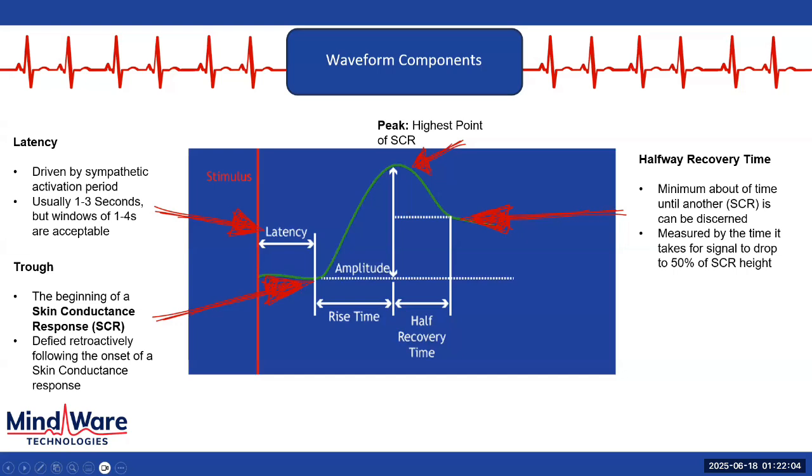Great. Another thing to talk about, in addition to those I just mentioned, is the half recovery point, which is helpful to know about. What this does is look, in time, from the beginning, the trough of that SCR, to the maxima, and then how long it took for that signal to come back down to the halfway point between the two, or the 50% mark.